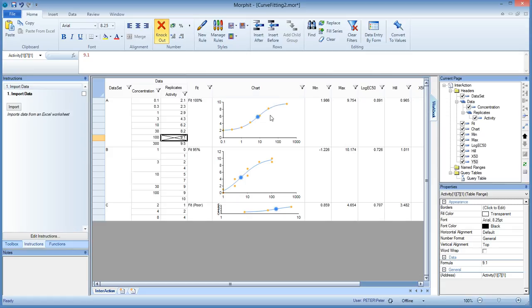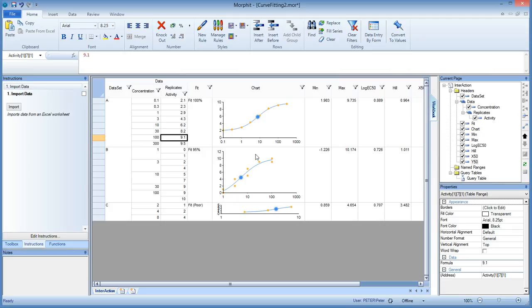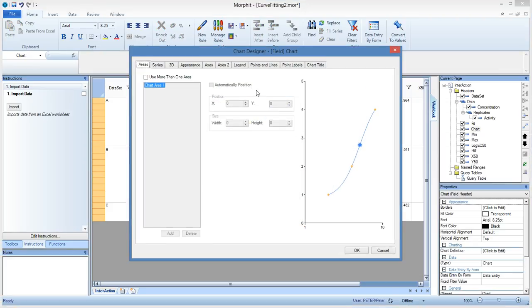And this is the default action on the chart. By the way, the fit is changing on the fly as well. You see these parameters changing when I knock in and knock out the data points. Right.